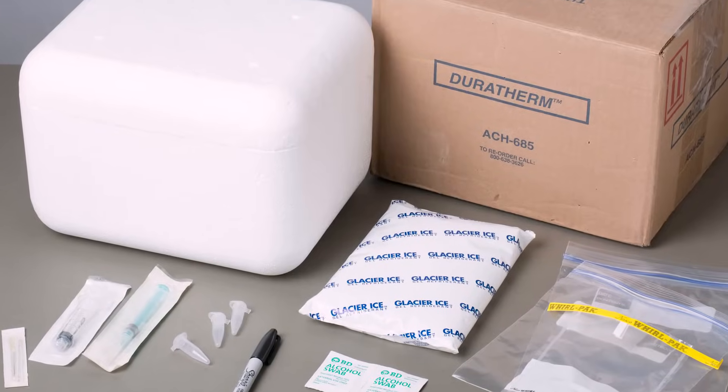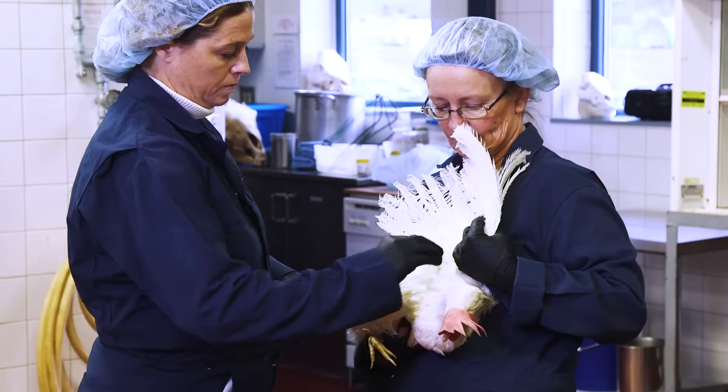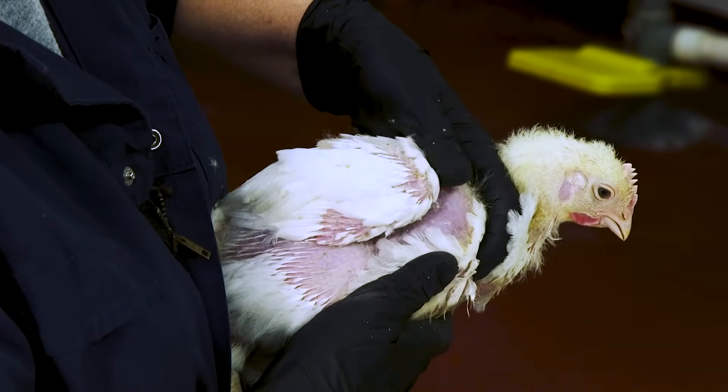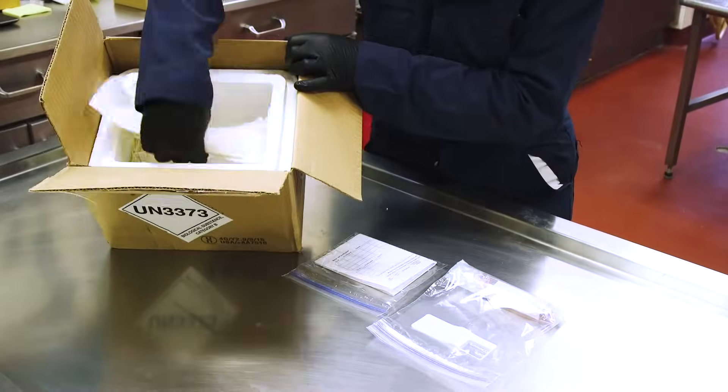In this video, we'll look at the supplies you'll need to take a blood sample, how to handle the bird when two people are performing the procedure and when one person is performing the procedure, how to draw the blood sample, and how to store and ship the sample for testing.